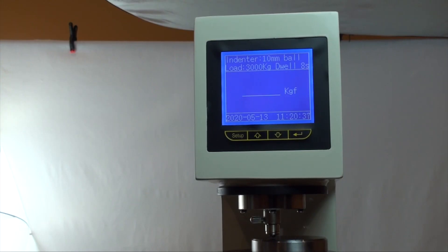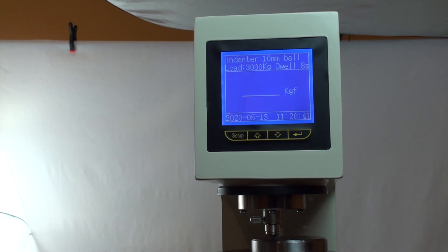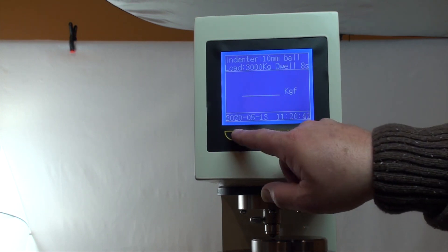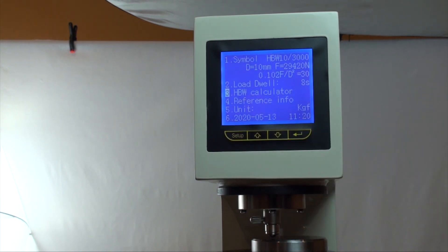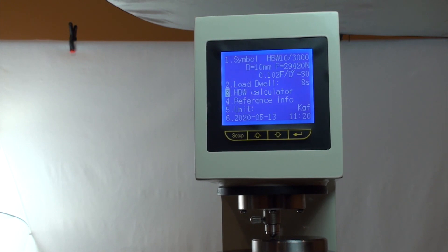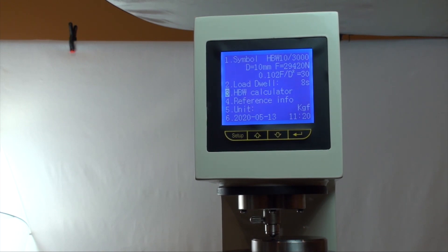To begin, let's go to the machine and to the main test interface. Some key features of this screen to point out: pressing the setup key on the left will bring you to the menu screen.